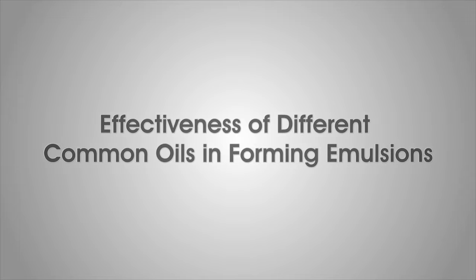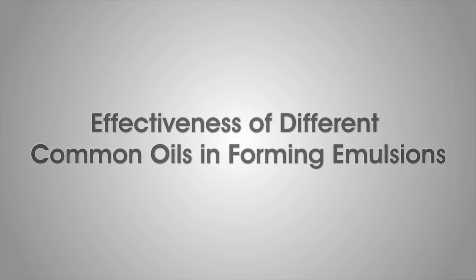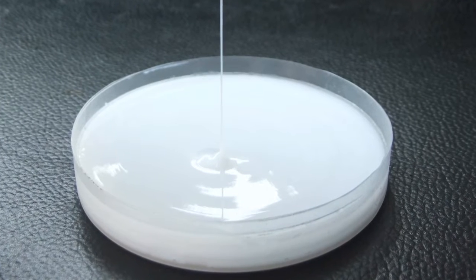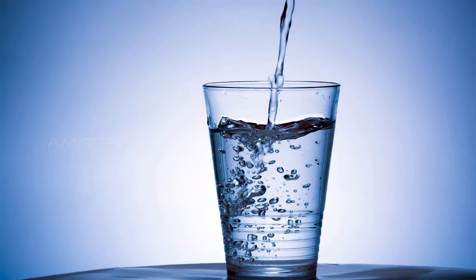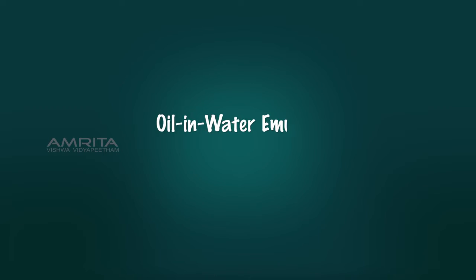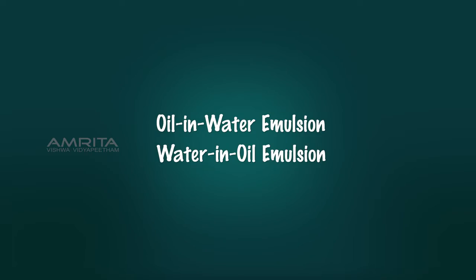Effectiveness of different common oils in forming emulsions. Emulsions are colloidal solutions in which the disperse phase as well as the dispersion medium are liquids. They can be classified as oil in water emulsion and water in oil emulsion.